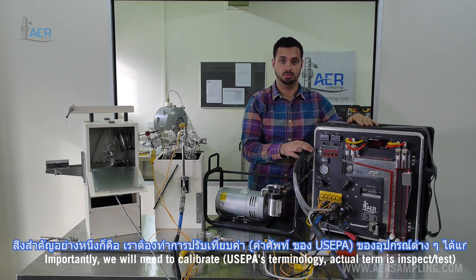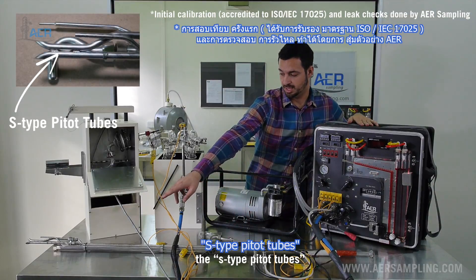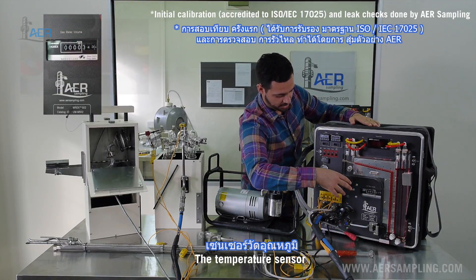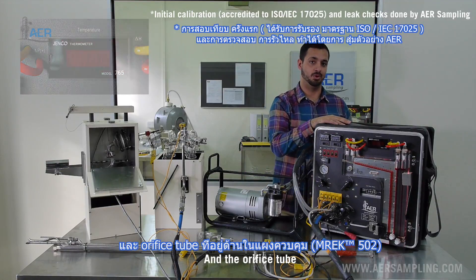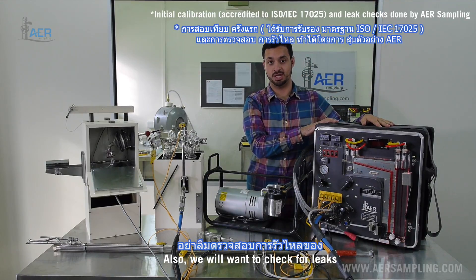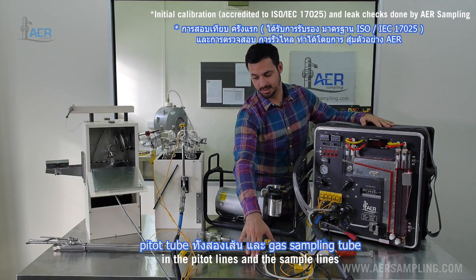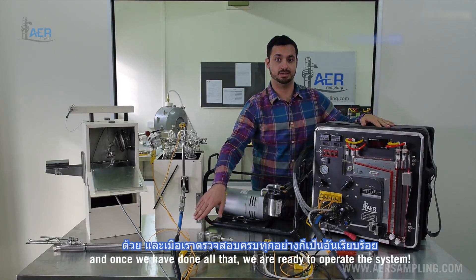And the manometer. Importantly, we will need to calibrate the nozzle, the S-type pitot tubes, the dry gas meter, the temperature sensor, and the orifice tube which is inside the metering console. Also we will want to check for leaks in the pitot lines and the sample line, and once we've done all that we're ready to operate the system.